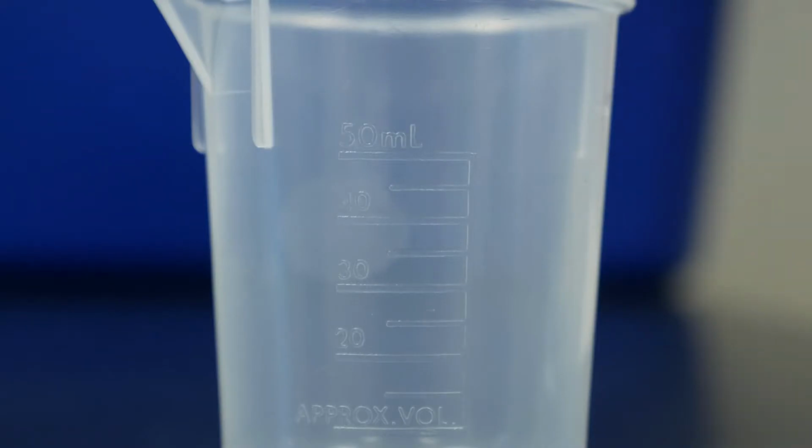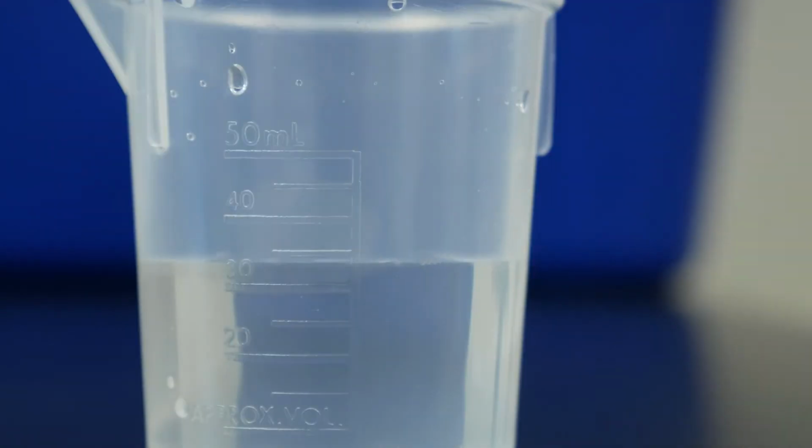All right, guys, this is part one of the lab. So we're going to take this beaker, which is 50 milliliters, and we are going to fill it halfway up with water. All right, so we have our beaker halfway with water here. Now we're going to put it in a graduated cylinder and see what the actual volume is.